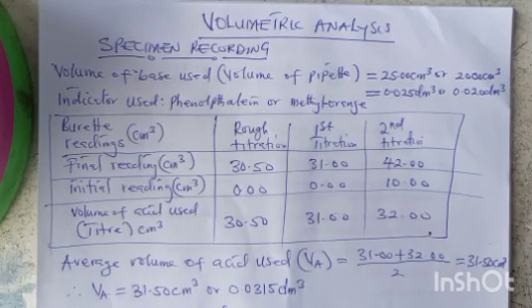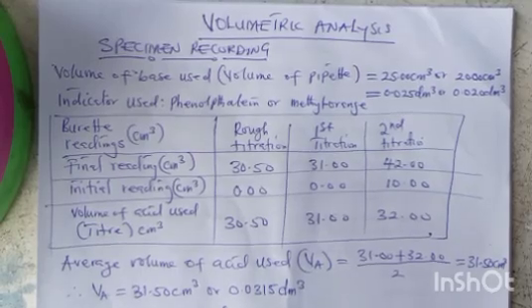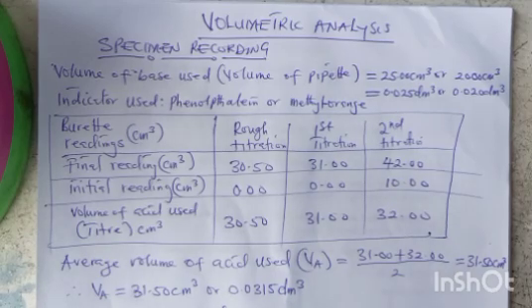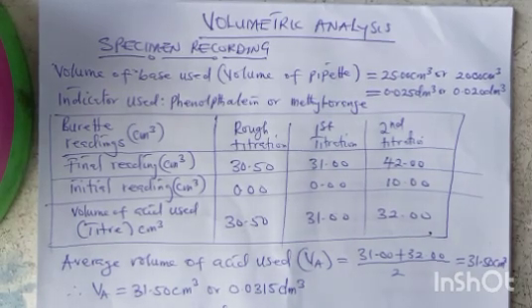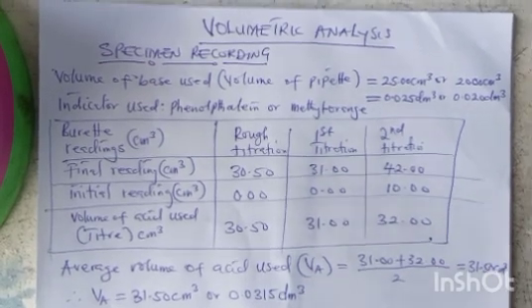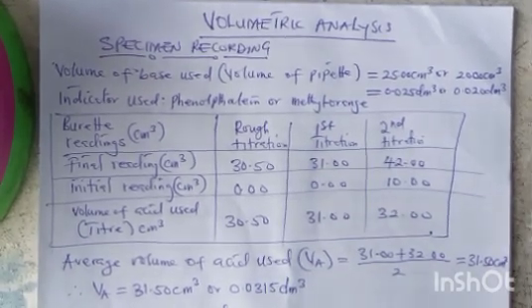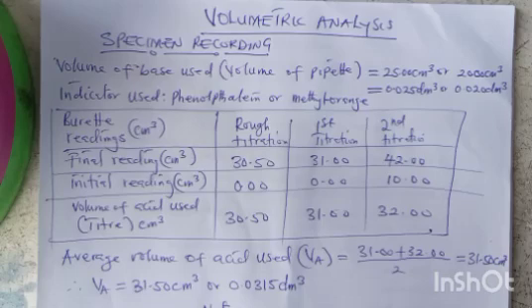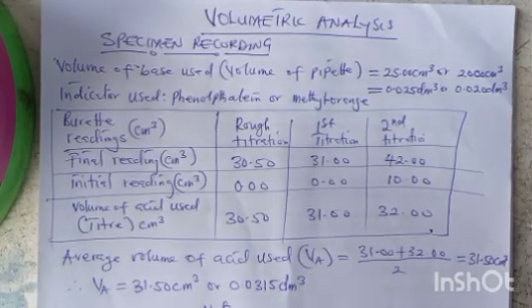One, the use of the pipette. Whenever you want to use the pipette, you have to wash it with soap and tap water. Also, try to maintain the burette in the same way, as well as the conical flask and the indicators. You need good knowledge of the indicator and the procedure for titration. I don't want to go into that area until we go to the lab to test some of these practicals, and these practicals are always there to guide you.